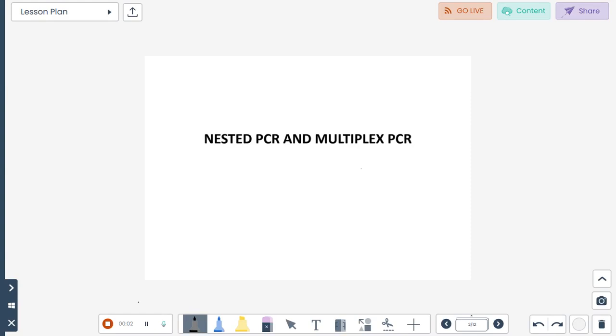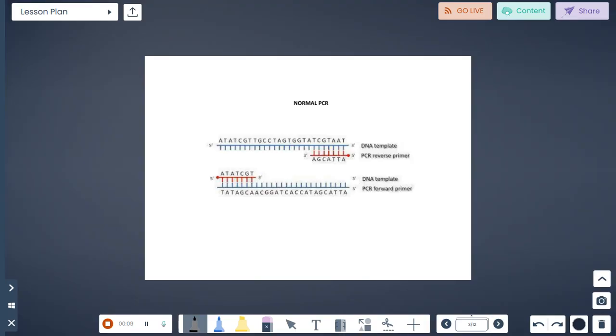Hello viewers, today we are going to see what is nested PCR and multiplex PCR. So before going to that, we will see how a PCR is actually done.